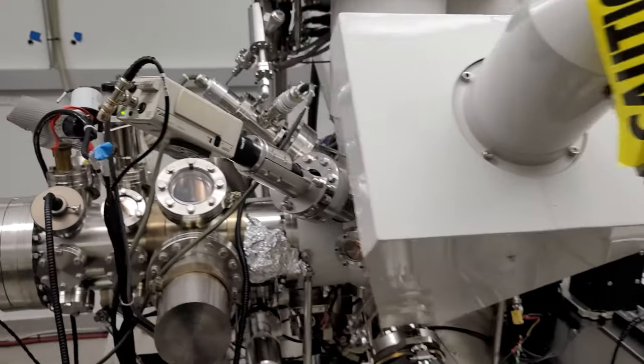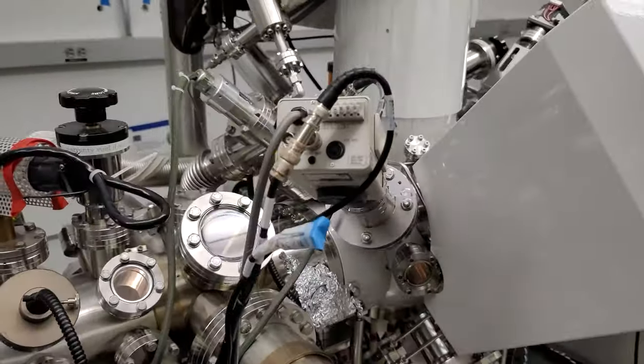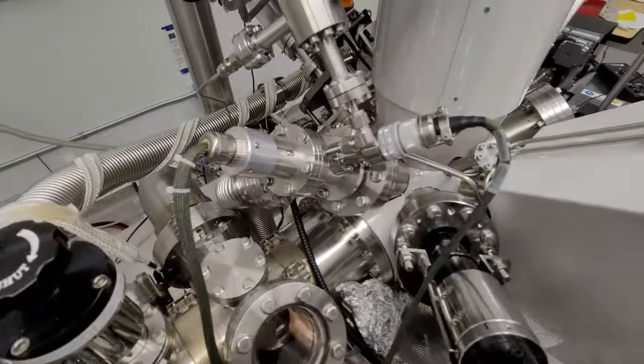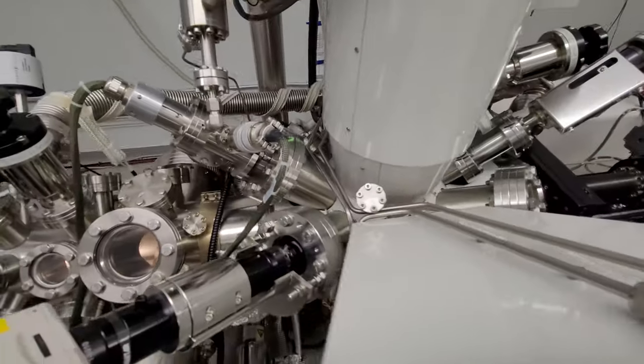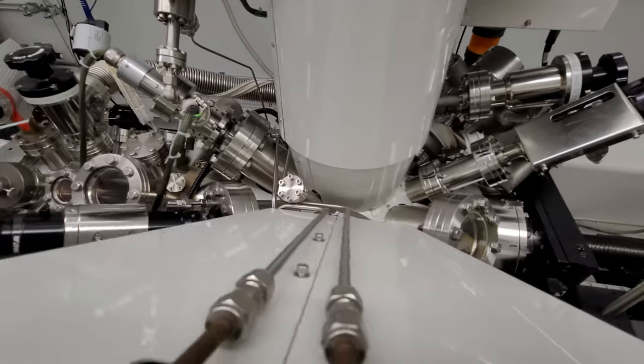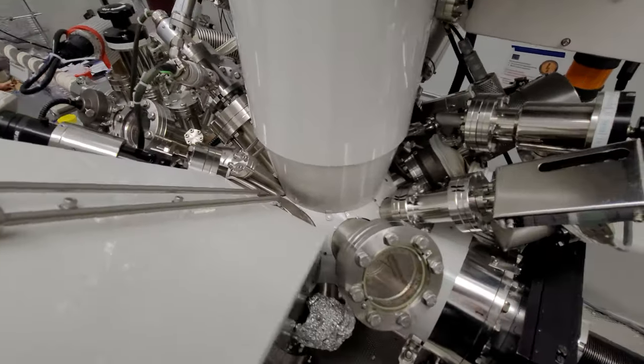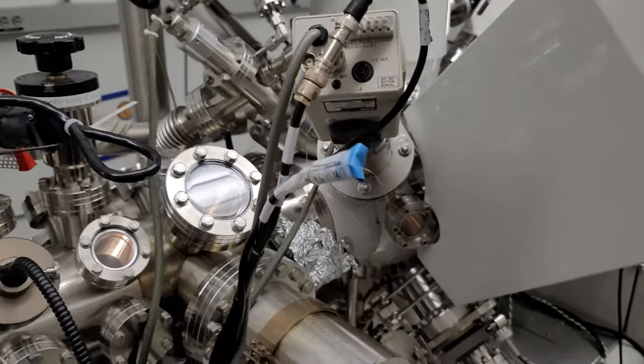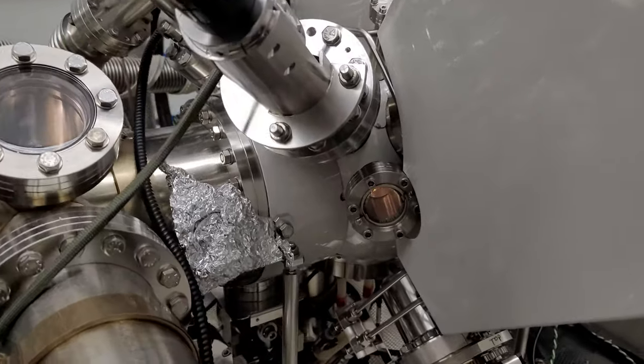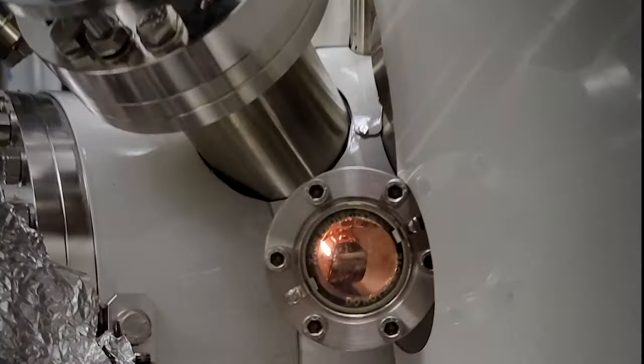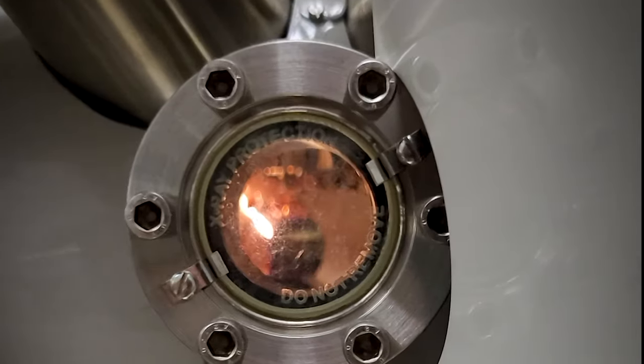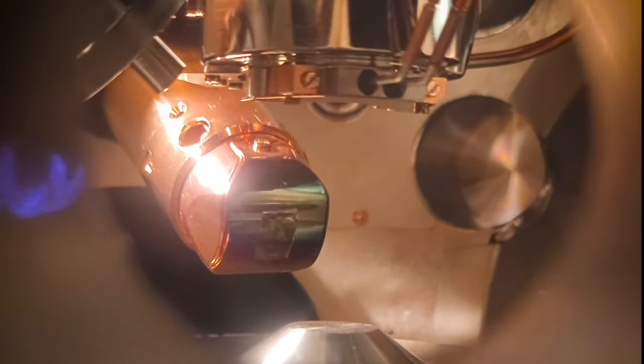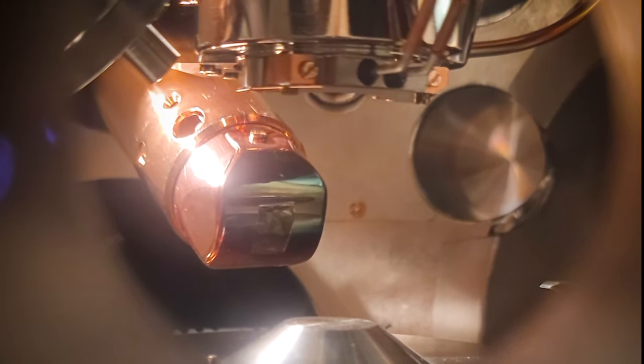The binding energy for a given element is sensitive to the oxidation state and the chemical environment, therefore allowing for the determination of the relative composition of component elements, such as the copper-to-bismuth ratio in our sputtered thin film. Furthermore, the very topmost elements can be identified using helium ion scattering spectroscopy, which is important for helping understand the function of multi-element catalysts as the surface atoms are the ones engaging in the catalysis. XPS measurements are critical to inform the composition and electronic structure of materials.